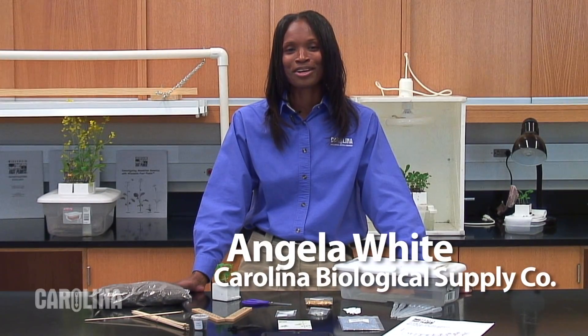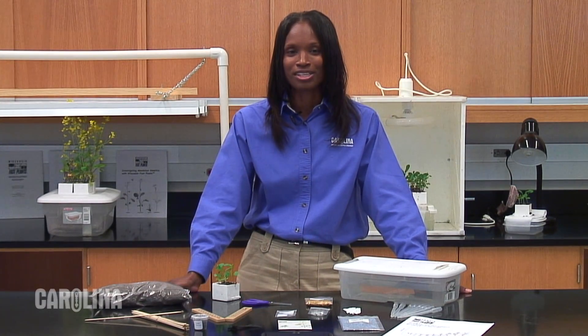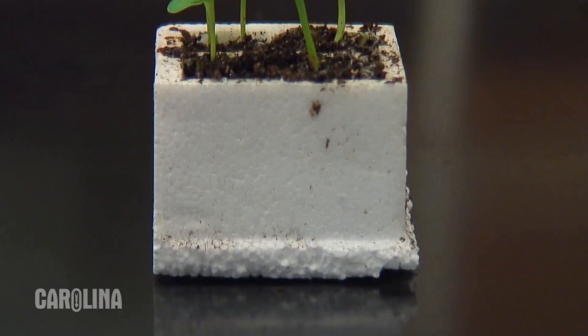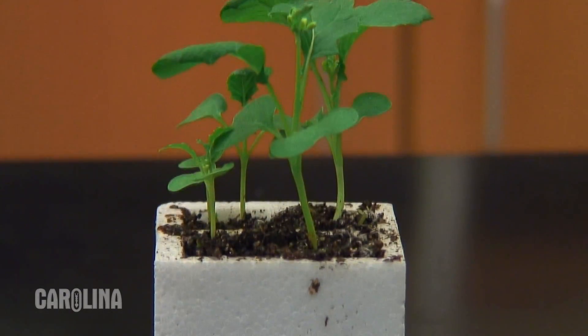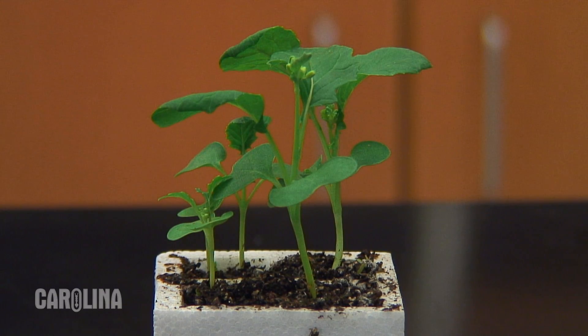Hi, I'm Angela White of Carolina Biological Supply Company. Today I'll be using our Wisconsin Fast Plants Growth Development and Reproduction Classroom Kit, along with a separate lighting system. This kit comes with everything you need to get started. Here's a planting quad with four fast plants growing in it. Let's go through the process of planting a quad and growing fast plants.